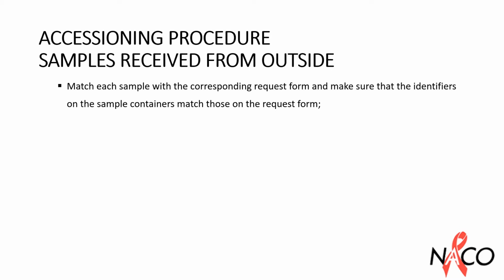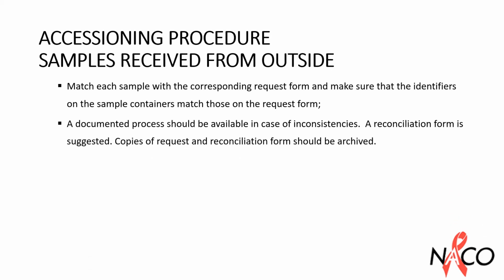If there is an inconsistency between the sample label and the request form, a procedure should be available in the laboratory to deal with these discrepancies. A reconciliation form is suggested. Copies of the request and reconciliation form should be archived.